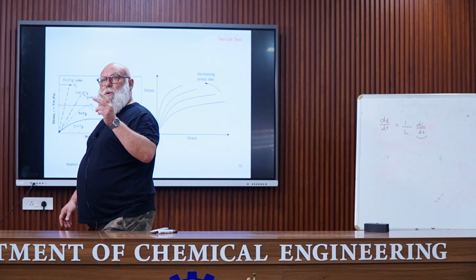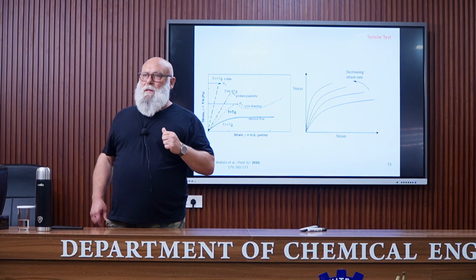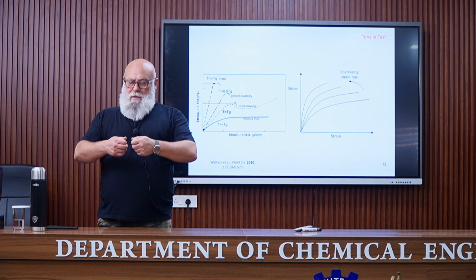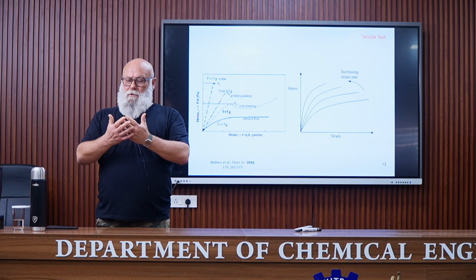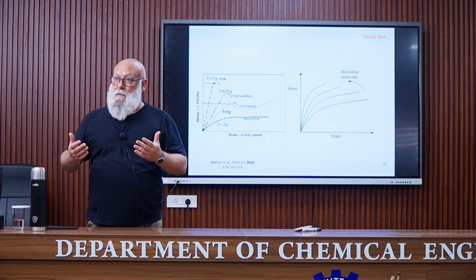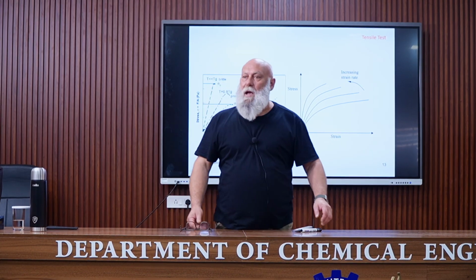There are two important parameters that need to be considered during this experiment. The first one is related to the material. When stretching a polymer, the macromolecule can deform easily or not. This refers to what is called the relaxation time.